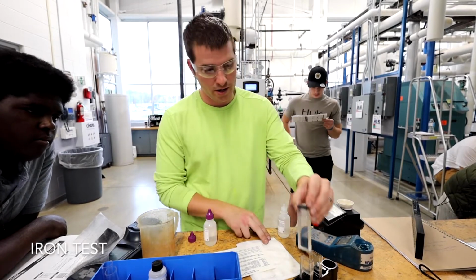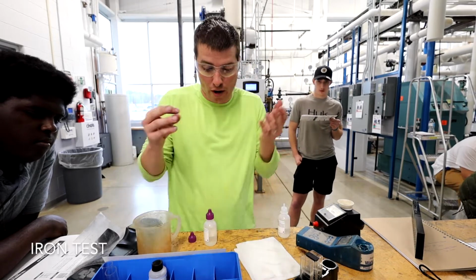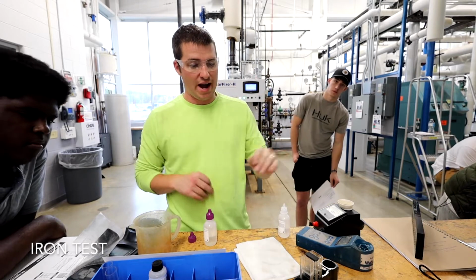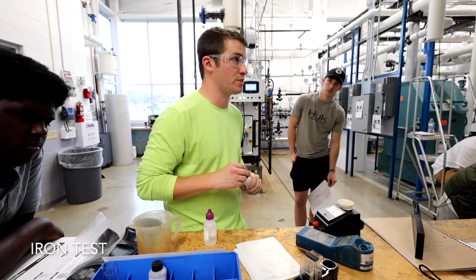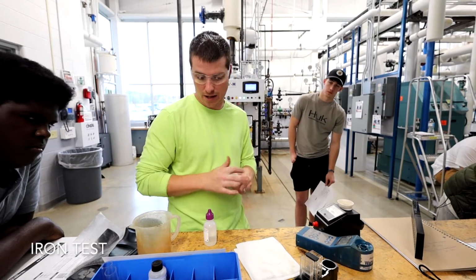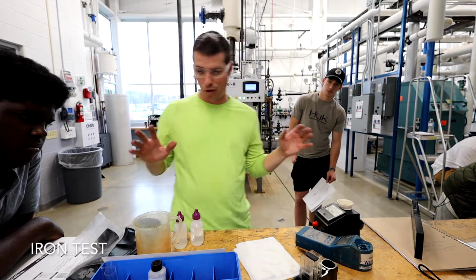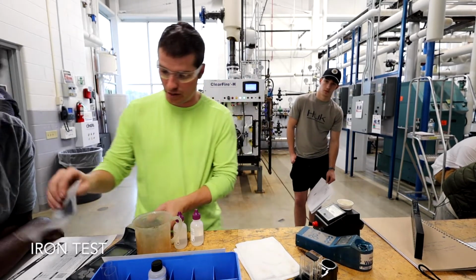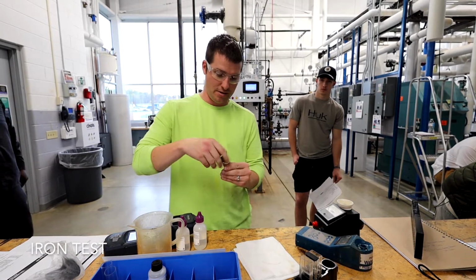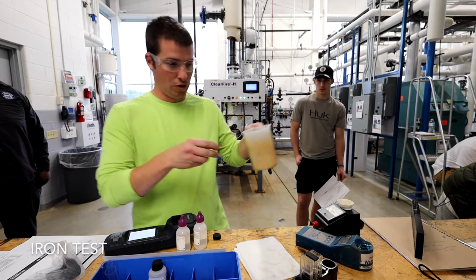Okay, then this is what I would do normally, because you have to wait 5 minutes. I would look at it as, okay, I got that prepped, I'm going to move on to doing a different test right now and not just stand there and twiddle my thumbs for 5 minutes, because I've got other things to do. If you've got some time to kill in the boiler room for whatever reason, do that. So why don't we just for fun do a side-by-side of my meter versus what we're going to get on that.